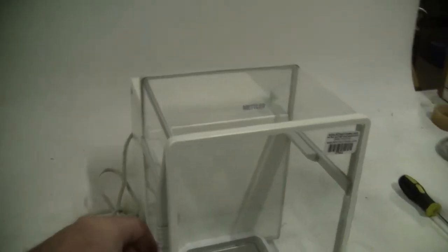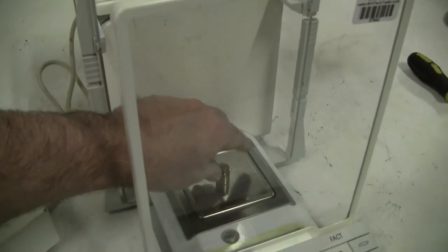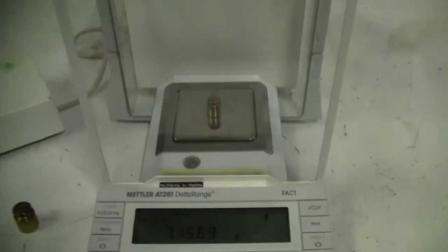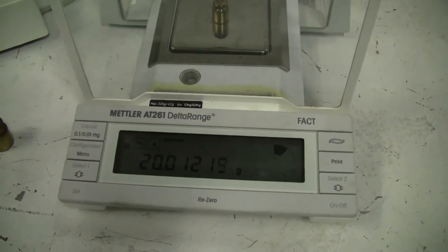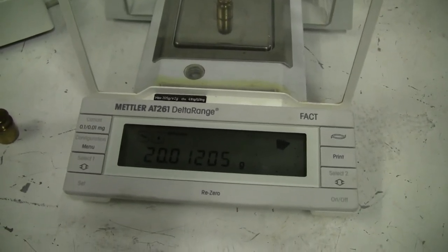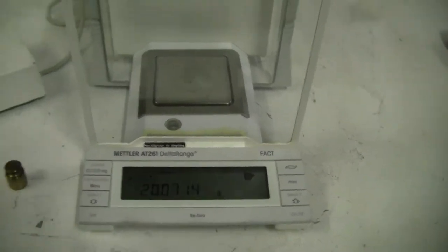Let's put some weight on it, take a look. 20 gram weight. There you have it, working very nicely. Take that off, take a look at another.